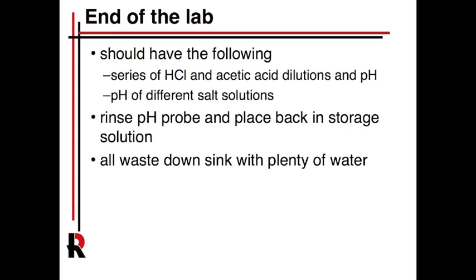So you have to remember each time to wash that probe off between runs, because especially if there's a little bit stronger acid on there, I would start at the weaker, the more dilute acids, and work my way up to the stronger acids for more accuracy.